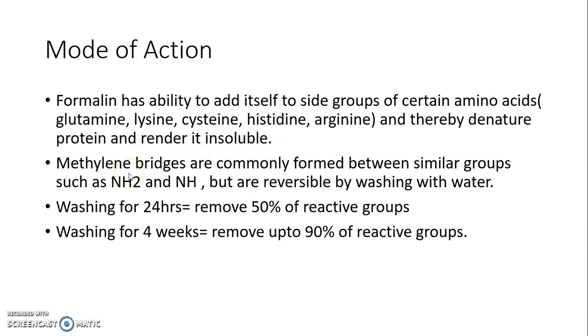Methylene bridges are commonly formed between similar groups, but they are reversible by washing with water. If they are washed for 24 hours, it removes 50% of the reactive groups. Washing for 4 weeks will remove up to 90% of the reactive groups that are methylene bridges.